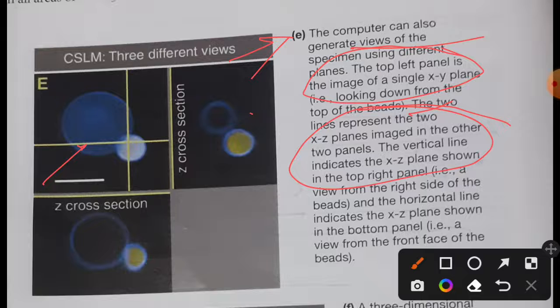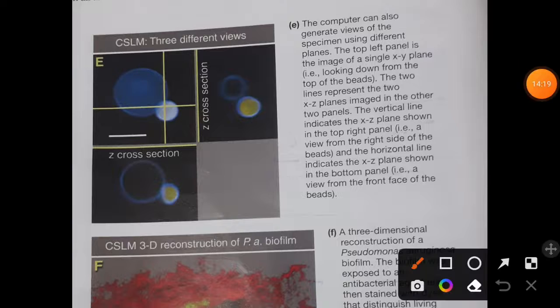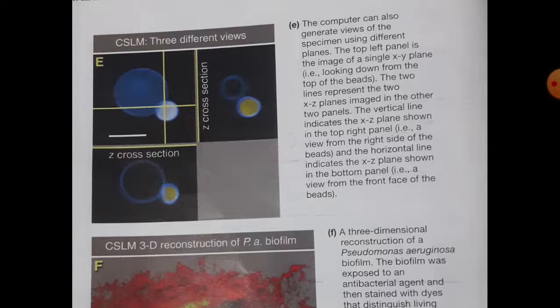So for remembering purposes I would like to recommend you to just remember that confocal microscopy allows the viewer to view the image from three different perspectives. So that is the idea of confocal microscopy.